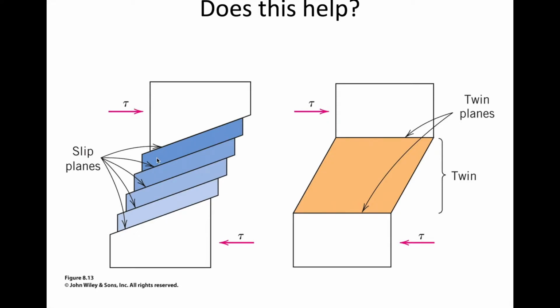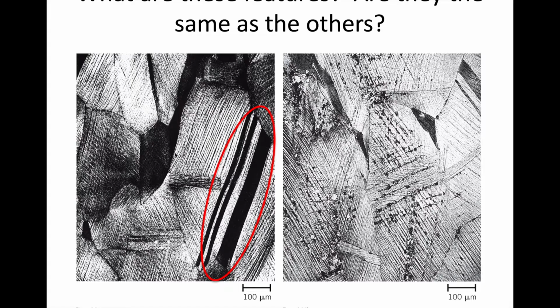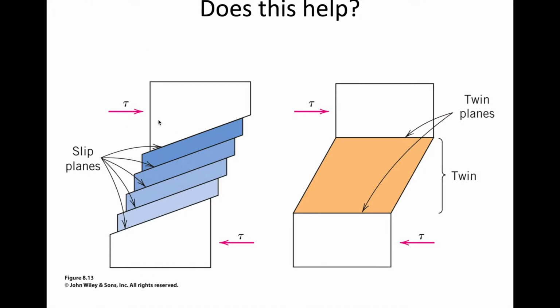So it's not a single dislocation, it's basically cooperative motion of many dislocations that we see. What we're seeing there, those lines, they're all at roughly a 45-degree angle, right, where the shear stress is maximized. Those are what we call slip bands. So if we go back here, these lines cross, you notice that it's cross-hatched too at roughly 45 degrees. That is slip bands. That's what we're seeing here.